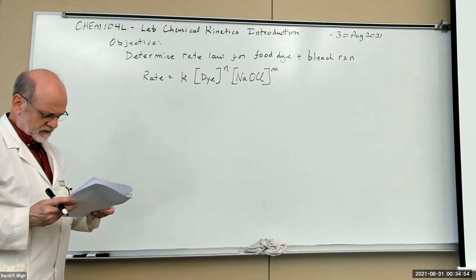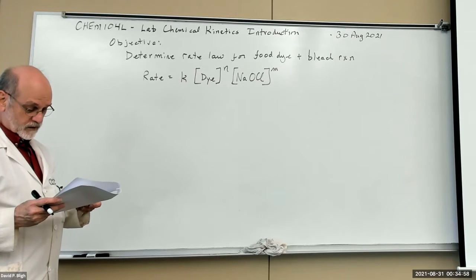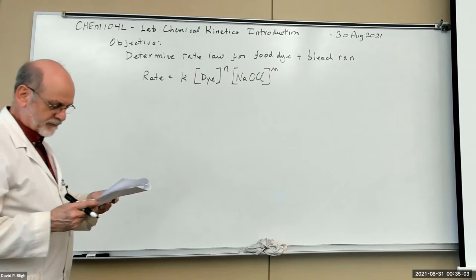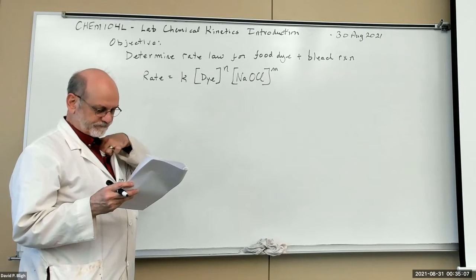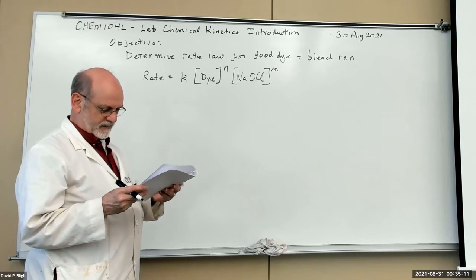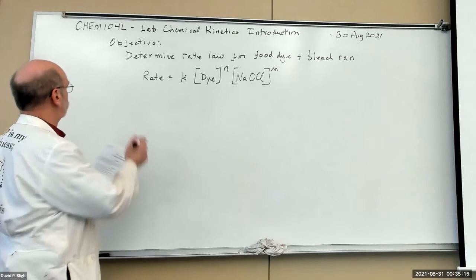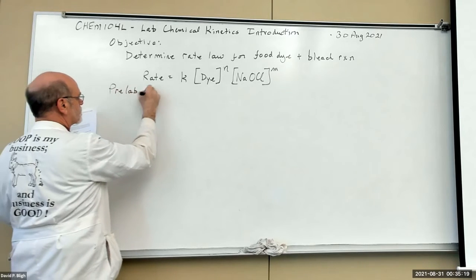Pre-lab questions, all right. Well, the first pre-lab question talks about determining the molarity of a 5% sodium hypochlorite solution. So that's a dimensional analysis problem.